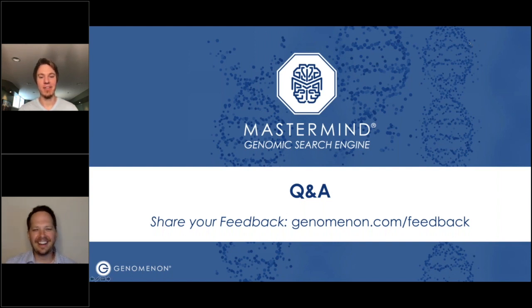I actually can. Everything that you mentioned is just scratching the surface in one respect, because those are all of the things that make sense. There's an entire class of variant nomenclatures that plainly don't make sense. For example, there are what we consider the colloquial nicknames, like in CFTR, you've got the F508 deletion that authors love referring to as delta F508 with a delta symbol, and there are about 50 different ways to represent a delta symbol in different character maps. So things like that we've addressed as well.